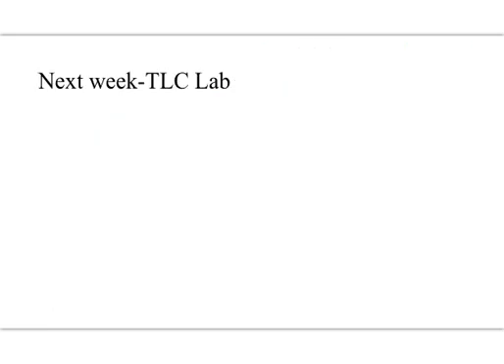Okay, so next week, again, this lab is not in your lab manual. We're going to do the TLC lab of the analgesic. So we're going to actually include our sample of aspirin that we make in this, and I'll do another video for that lab for next week.